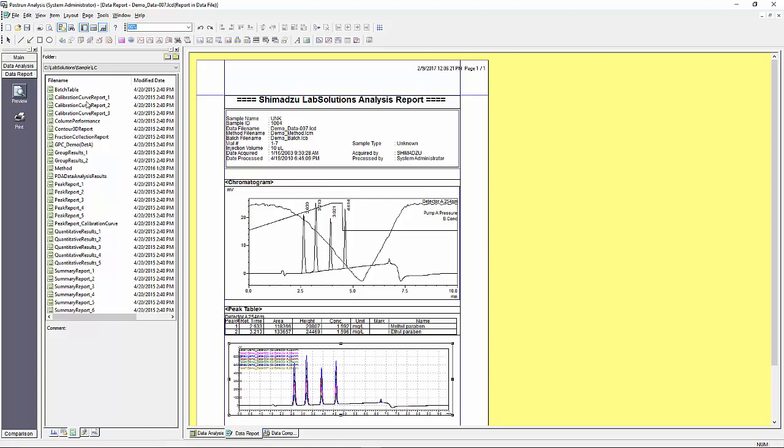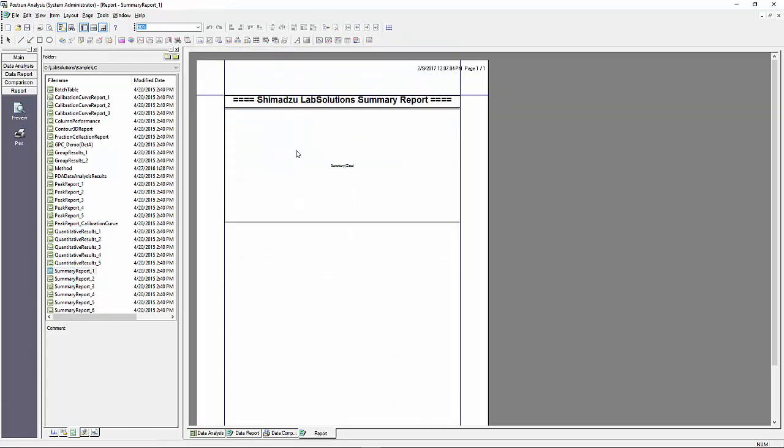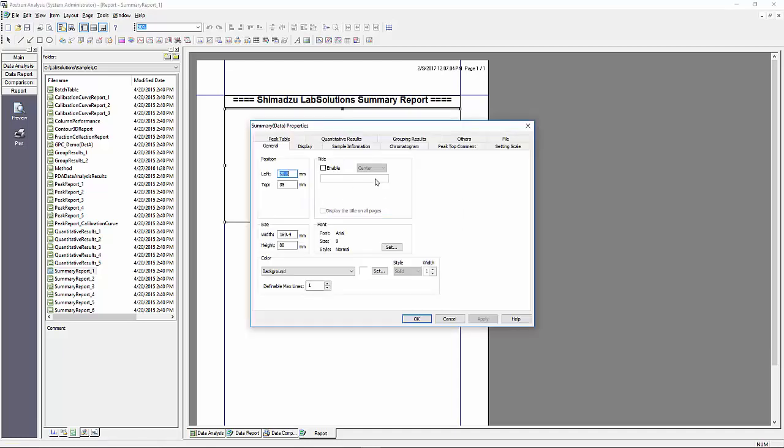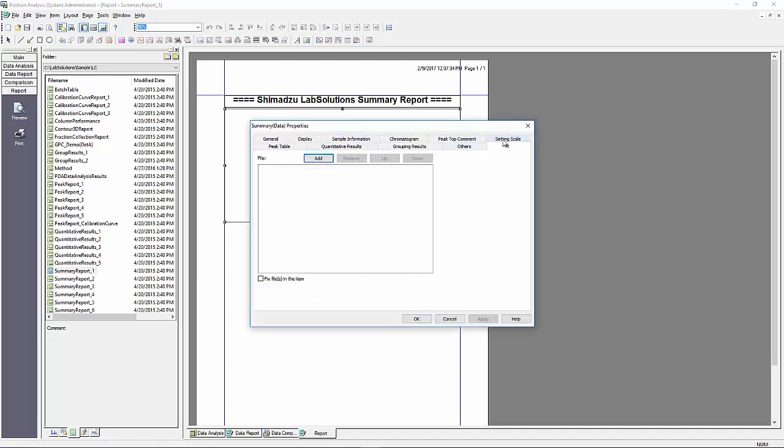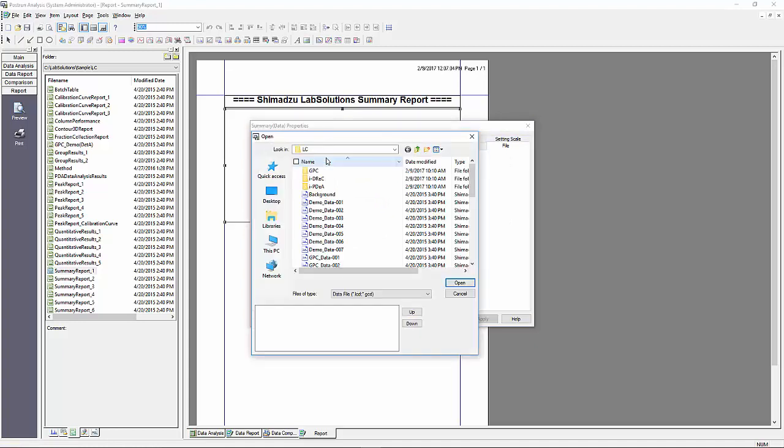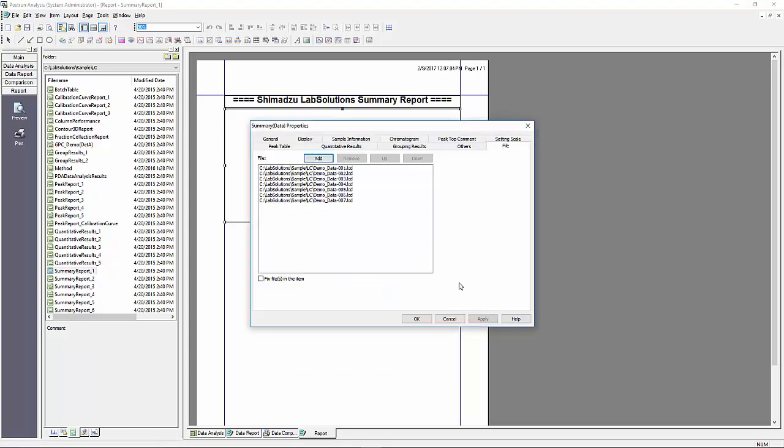These report templates have been made for you either as a final solution or as a starting point for you to make your own custom report template. They are intuitively named to reflect their purpose. In this case I am opening a summary report template. Once it is opened I will need to select the data files I would like to be used in this report. To do this go to properties and then select the file tab. Click on the add button and select the data files you would like to have included in the report.